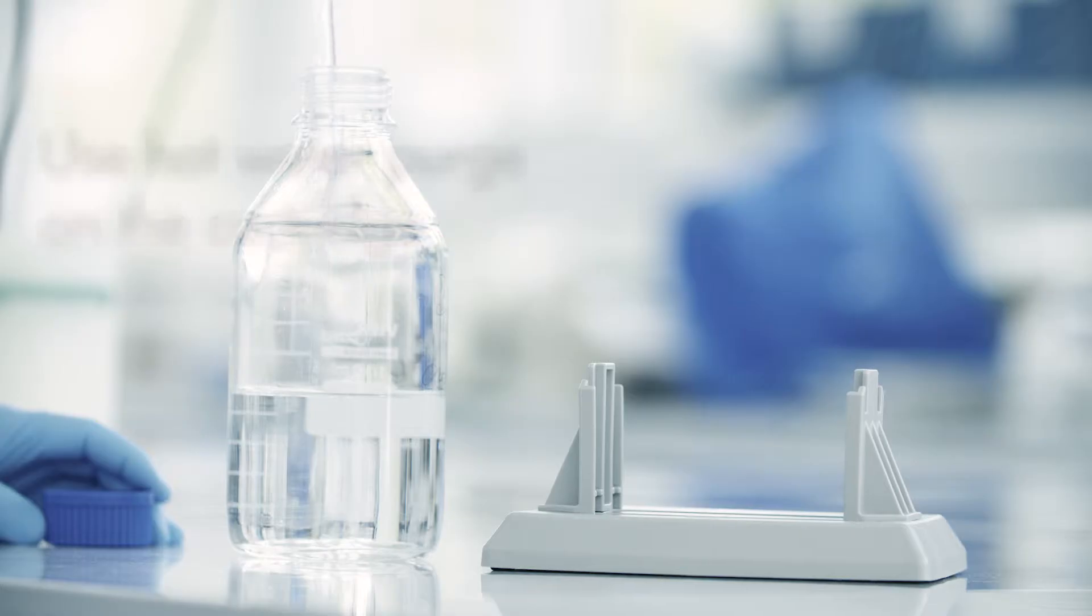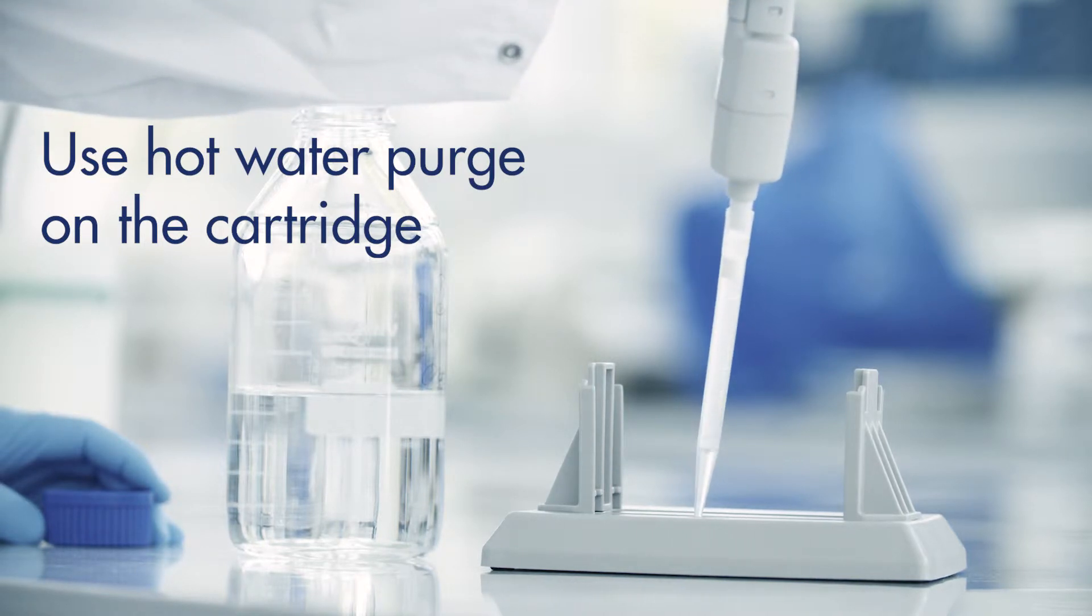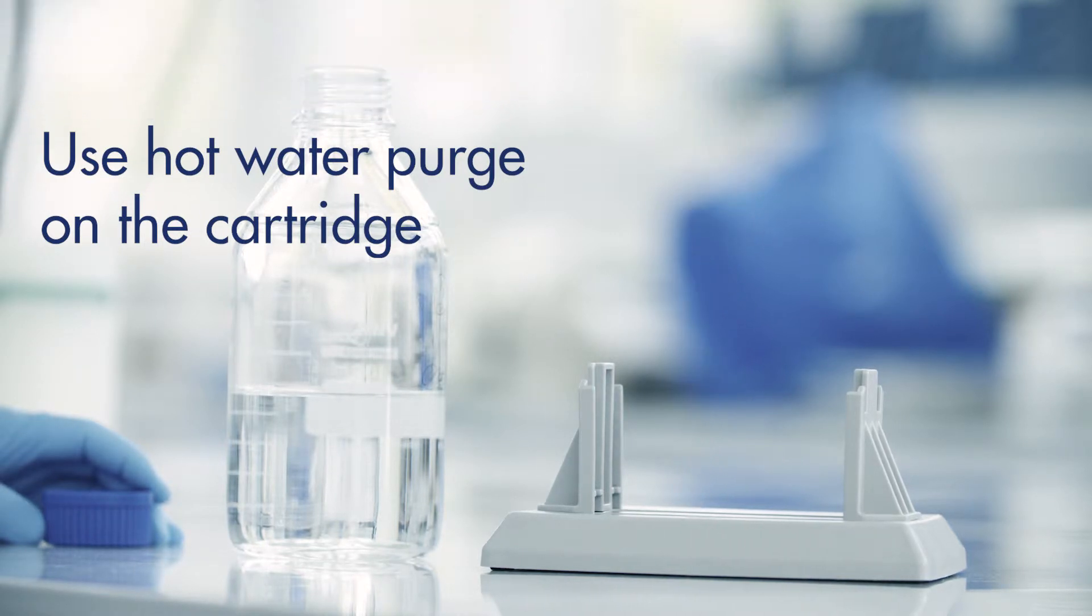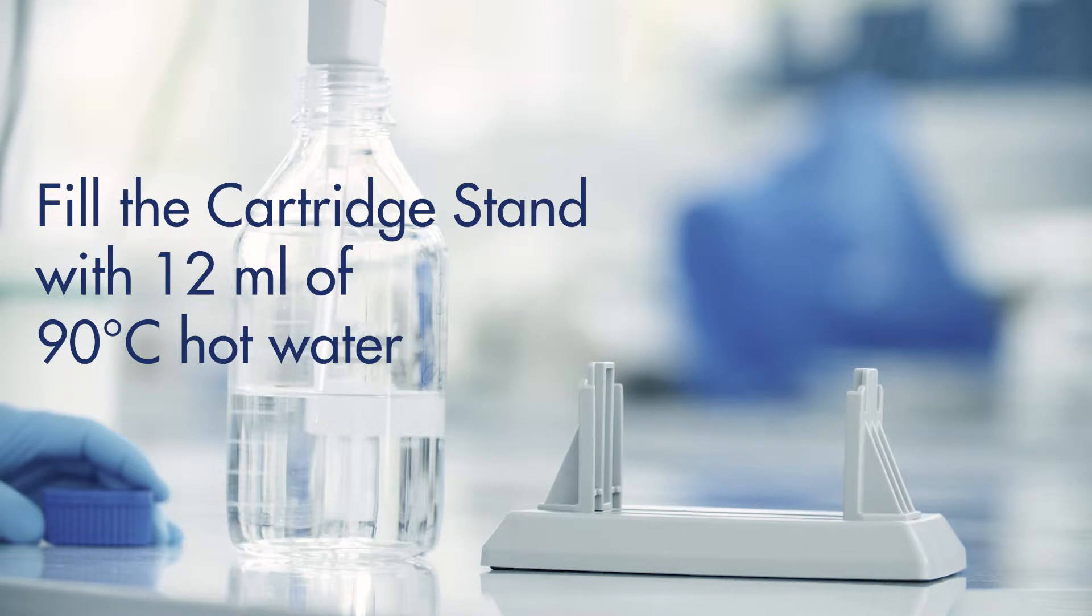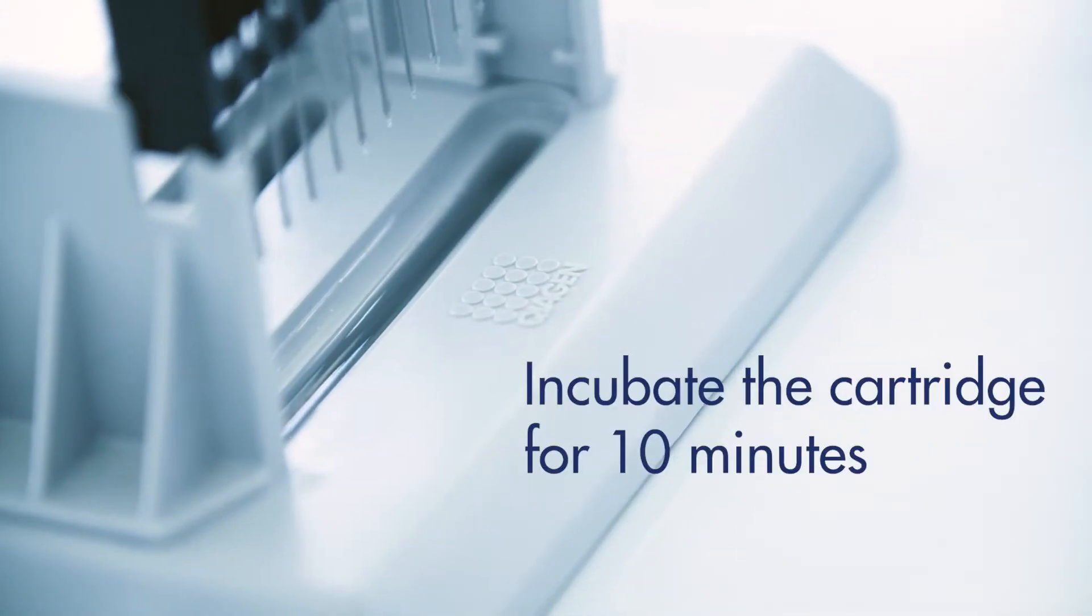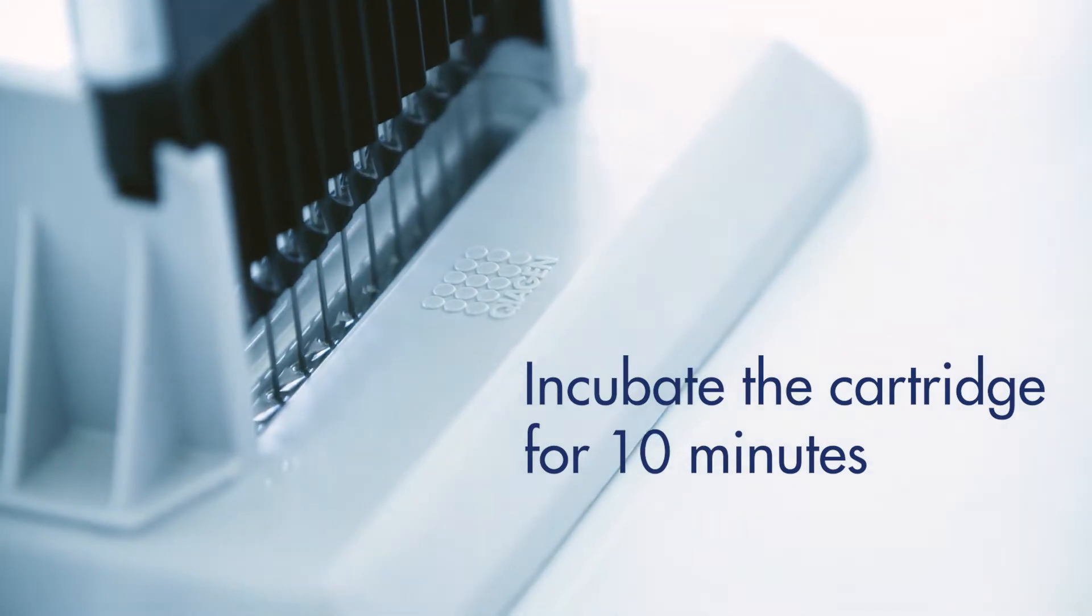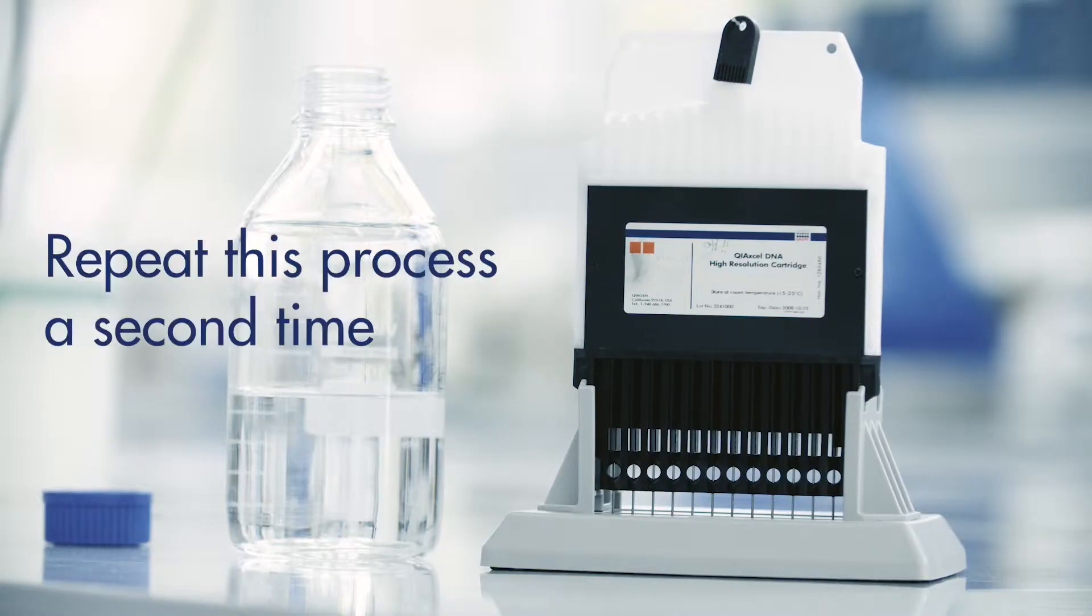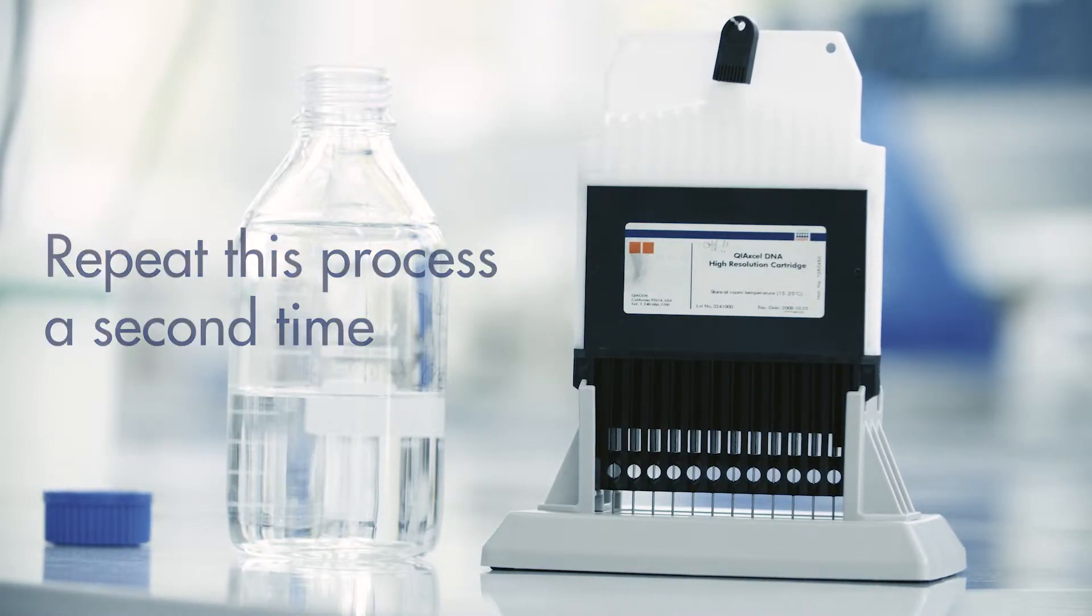In such cases, we recommend performing a hot water purge on the cartridge. To do so, first fill the cartridge stand with 12 milliliters of 90 degrees centigrade hot water and incubate the cartridge for 10 minutes. Repeat this process a second time after exchanging the hot water.